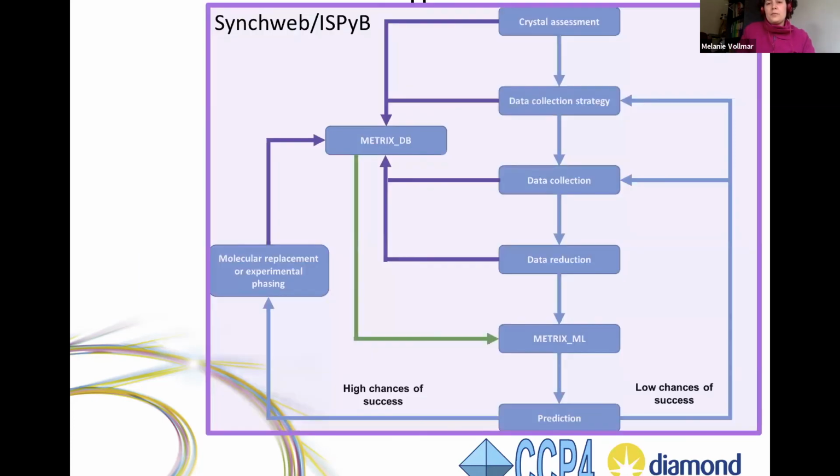And the whole system then needs to be, currently I have, this inner circle is sort of my own development at the moment in order to get to grips with the whole system. But this will essentially be overtaken by our user interface, which holds all of the user data, and then creates a feedback loop system within our own database, executing the different analysis pipelines based on the predictions. So that's where we are with the experimental phasing.